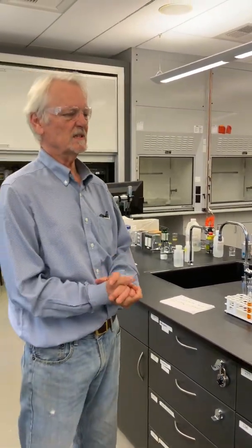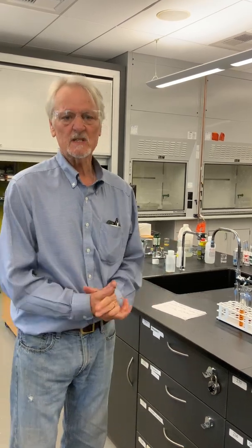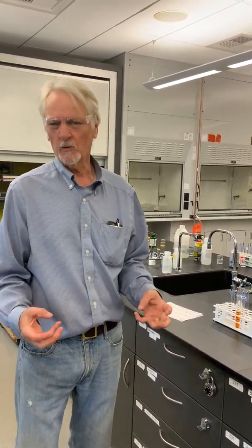Greetings! Today a demonstration of the all-important Le Chatelier's principle in chemistry, one of our most important ideas that relates to chemical systems in this concept of equilibrium, where both the forward and reverse reactions can happen, and as a result, conditions dictate that those rates become equal, and we have the so-called condition of equilibrium.